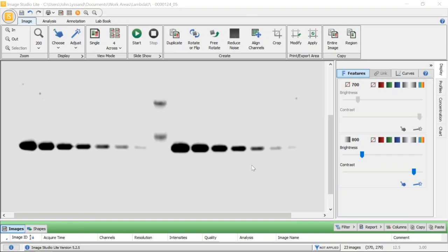Hello. Today in this section, we'll be walking through how to properly quantify Western blot bands. For this segment, we'll be using a free analysis software from LICOR called Image Studio Lite. Image Studio Lite can be used to analyze images from Odyssey Imaging Systems, as well as other imaging platforms and scan film. Many of the concepts we'll walk through today are applicable to Image Studio software.